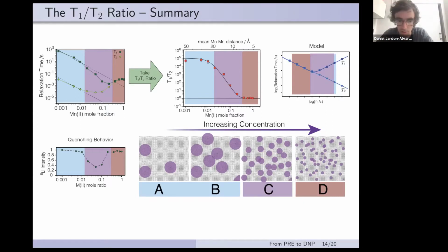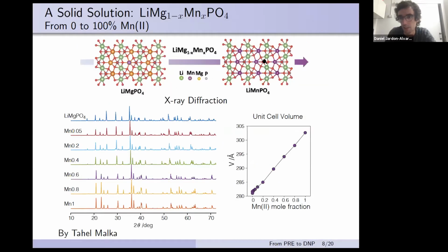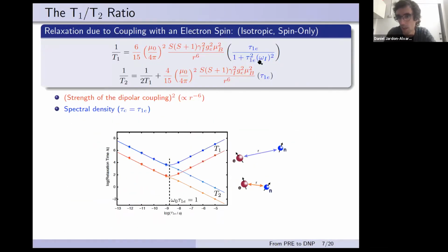No, there is no spinning speed dependence at all, because for the paramagnetic relaxation enhancement the relevant values are the nuclear Larmor frequency, and the correlation time is very short. You would expect T2 to change if the correlation times become long, but this hasn't been the case for us. The electron relaxation, or the T1e here, is still so short that the spectral density function at zero frequency becomes the spectral density at the spinning speed frequency, but because the spinning speed is so small compared to T1e, we don't see any changes in T2 with spinning, and in T1 not at all.